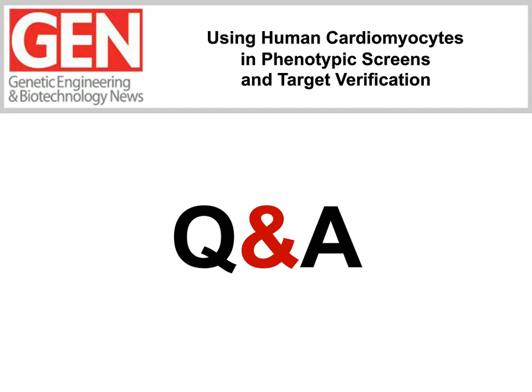Anne mentioned some of the challenges in trying to follow up with chemistry because of phenotypic, and that's why we did the proof of concept study with the known libraries, to show that we could, in a suspension assay, pull out compounds that in fact have mitochondrial protection activities that are shown in the literature. So the hope is we'll find different novel compounds with novel mechanisms.